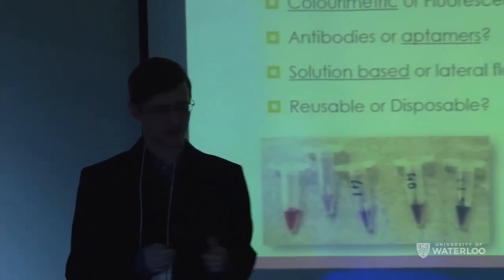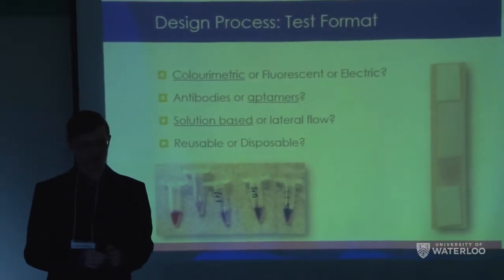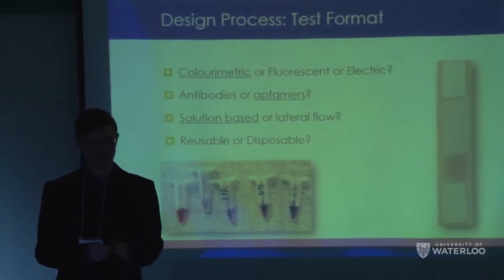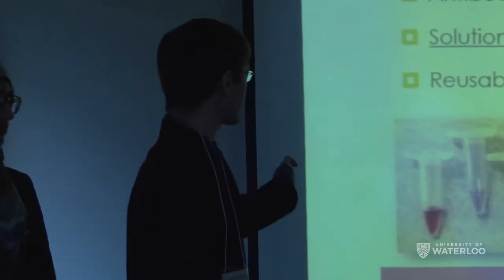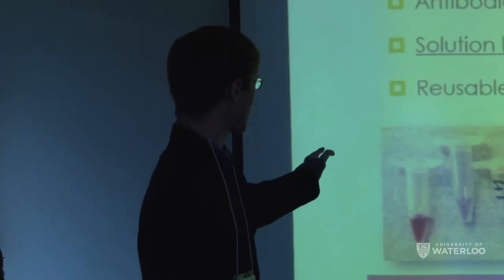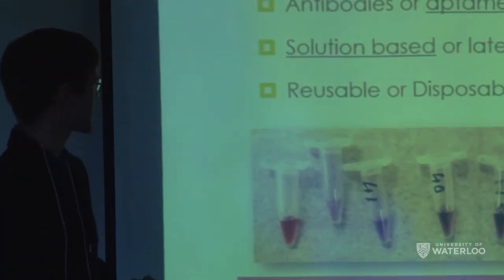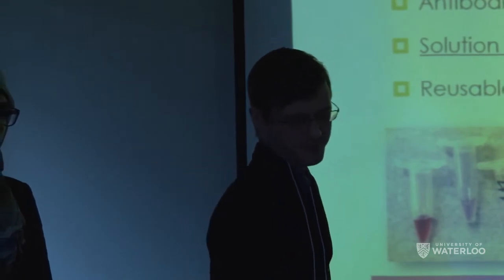The next question was solution-based or lateral flow. The choice for us here wasn't entirely clear. It's much simpler to do something in solution often, but lateral flow uses far less reagent, so it'll be cheaper, and it also has no risk of spilling. We've included a picture of our current results in solution, and you can see a wide range of colors that we've observed, and our attempt at a lateral flow strip, which currently isn't working. In the future, we may like to expand to lateral flow.